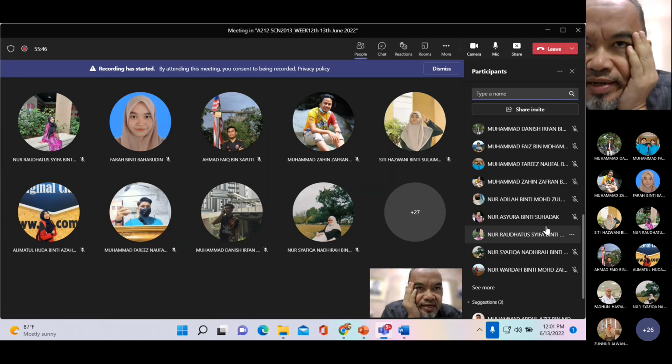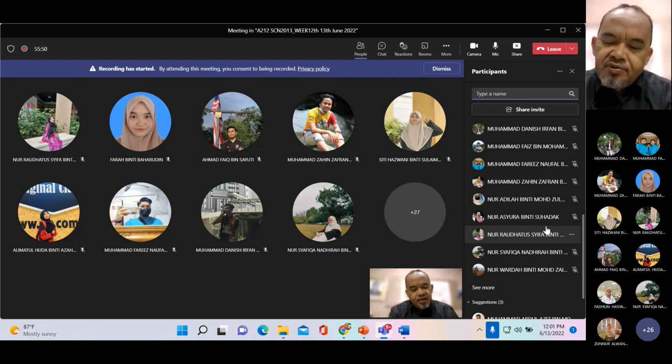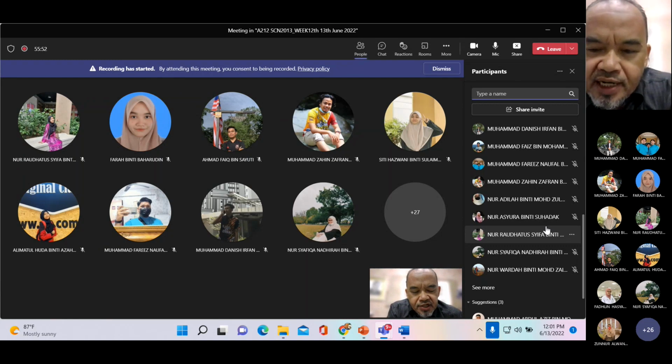Untuk dia fluoresce tu, kita mesti boleh excite dia dulu kan, betul tak? Because excitation can only happen, or fluorescence can only happen, if you manage to excite the electron. If you cannot excite the electron, there is no way you can get the fluorescence. And then, how can we excite the electron? By giving energy, isn't it? You giving energy will be absorbed.